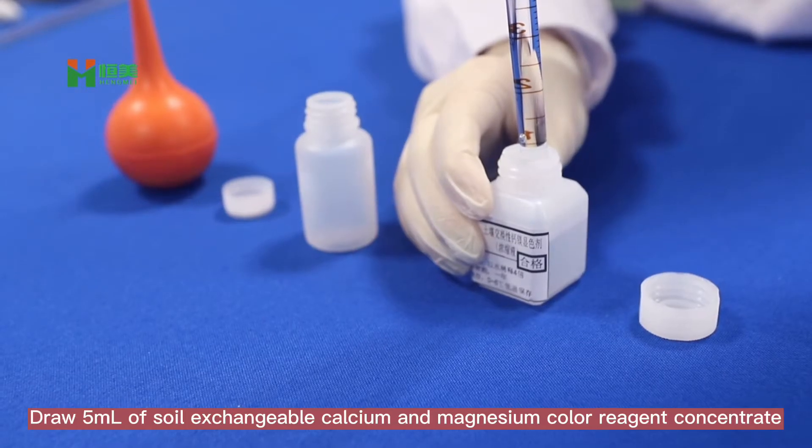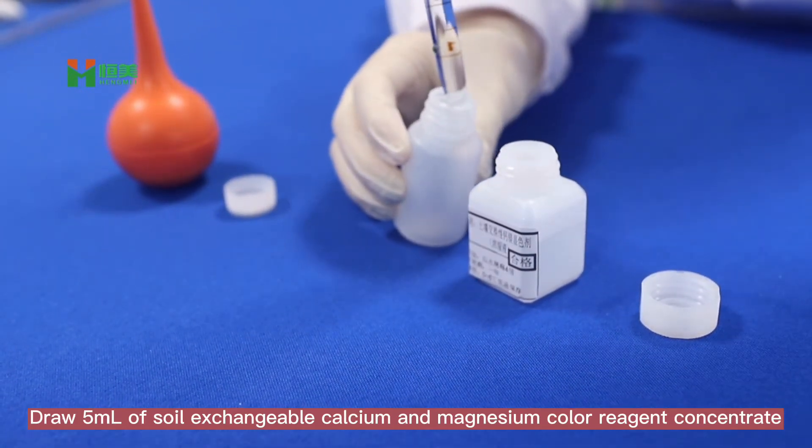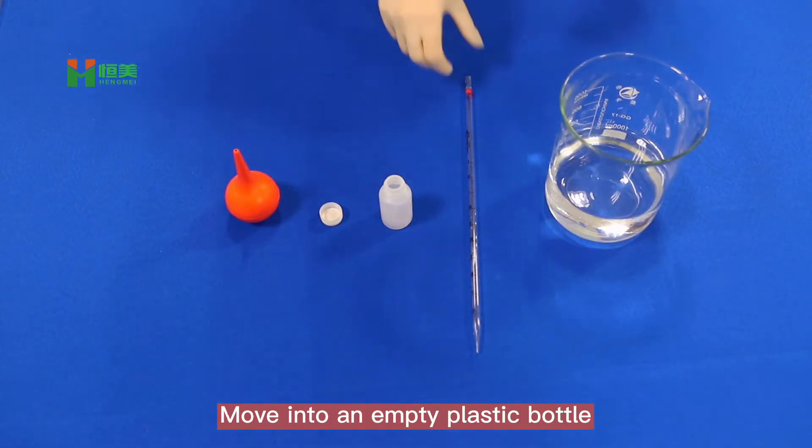Draw 5ml of soil exchangeable calcium and magnesium colorimetric agent concentrate, moving it into an empty plastic bottle.